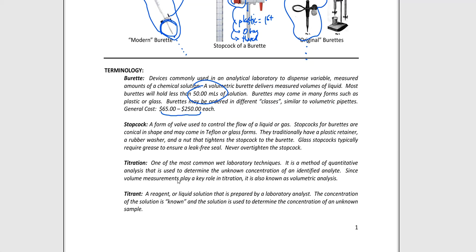So things are going to happen. I don't want you to get worried with it, but things are going to happen in the lab, and you're going to be a little klutzy sometimes. I'm klutzy sometimes, and I'll break things sometimes, and you'll break things sometimes, and it could necessarily be a burette. Absolutely, it can be. So don't freak out or worry about it, but at the same time, please pay special attention, because somebody's going to have to fork out the bill, and that somebody is going to be me. So just handle them with care, please.